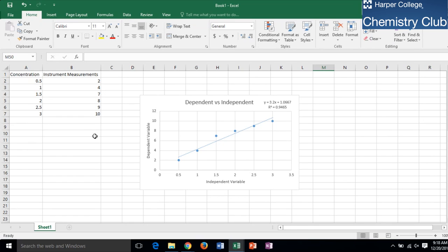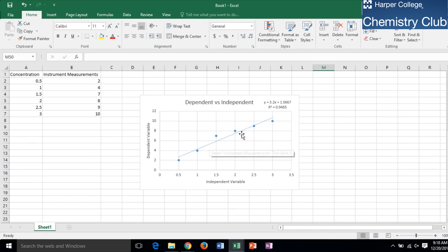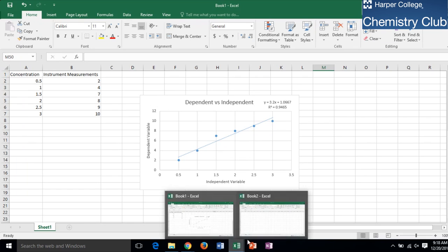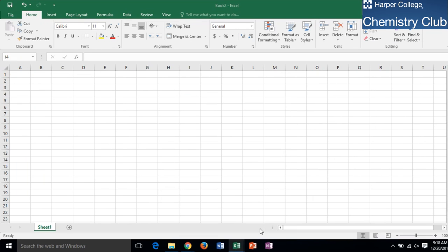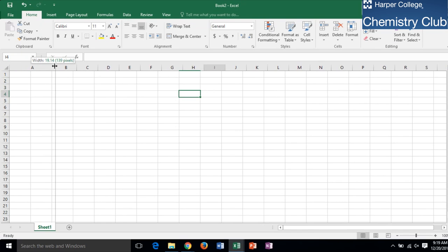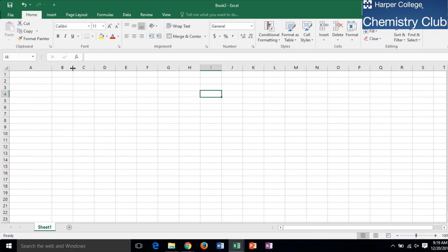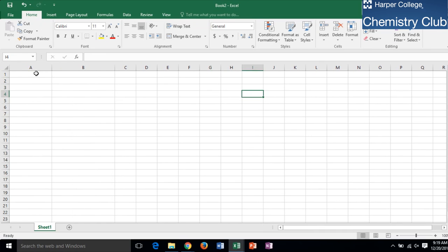Each data point is a sample of the known value. To create a curve, first enter your data points. The independent variables go in column A and the dependent variables go in column B.